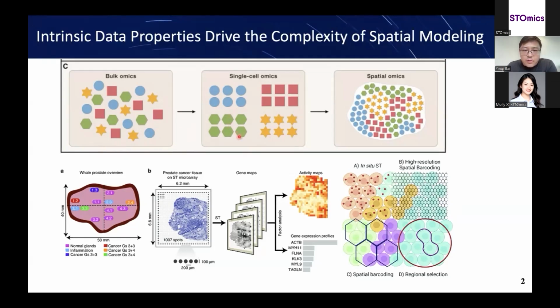When we go to the single-cell RNA field, now the cell number increased a lot. We have thousands, tens of thousands, even hundreds of thousands cells. This analysis becomes a populational analysis. Notice that when we compare the different gene expression between two cell types, it actually compares the populational differences.